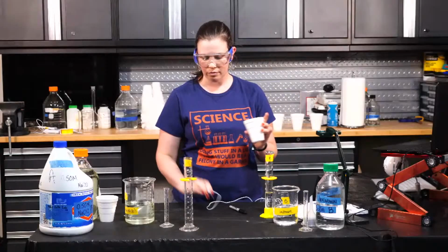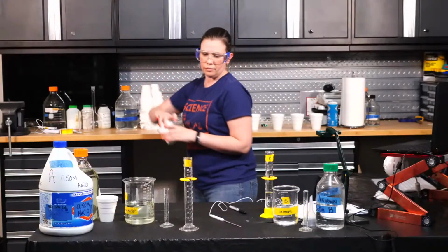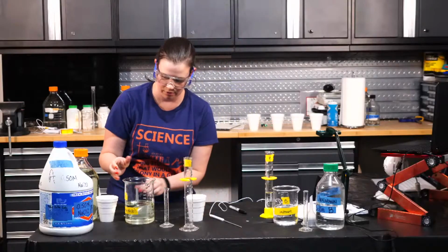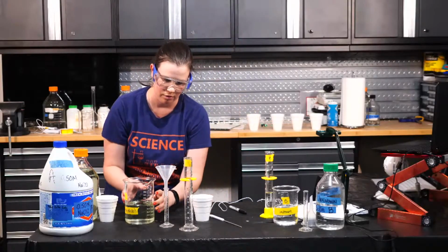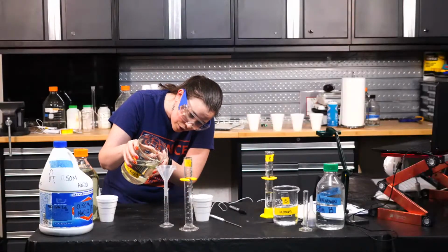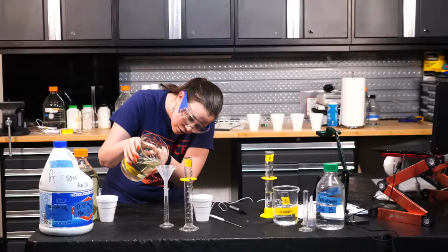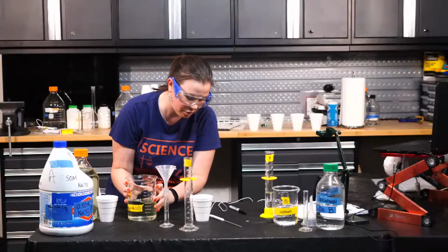So I think I might refill this 5 milliliters. New cup, nothing in it. Maybe I did accidentally put a drop in there or something. Okay, so there's my 5 milliliters.